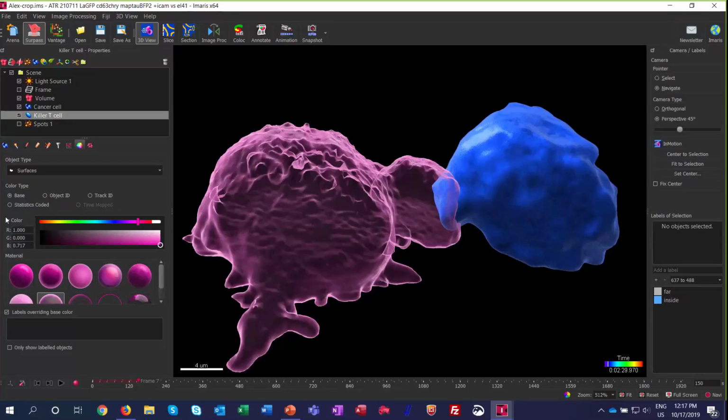You can also go in, I've hit this triangle and opened up this box down here. You can make it more saturated, you can add some gray to it, and so you can play around and adjust the color exactly to your liking by going into this view. Okay. So you have these options. Again, I want to point out that this cancer cell does have one of these textured options here. You do have all of this available whenever you're rendering surfaces.